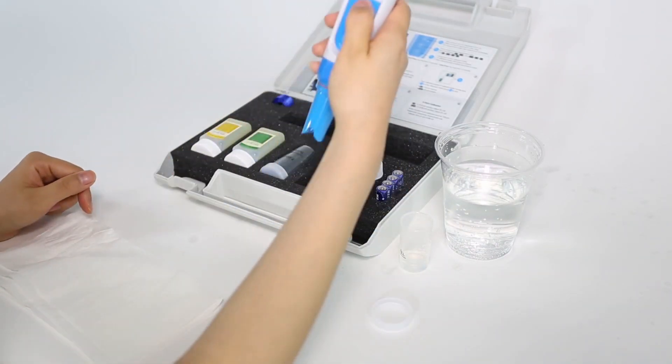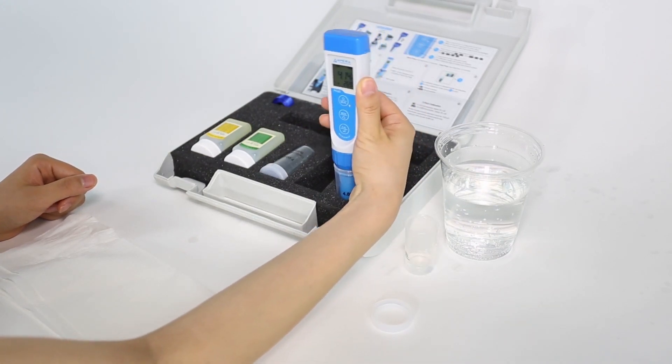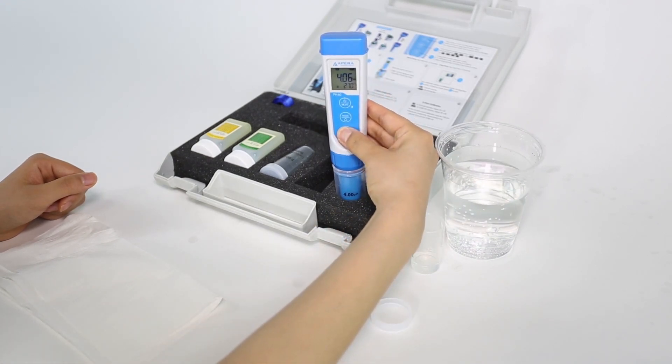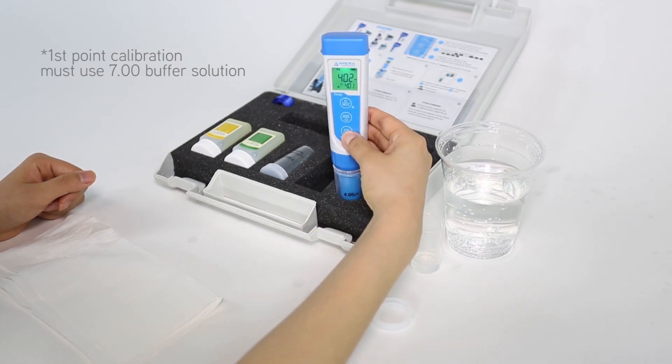For second point calibration, dip into the 4.00 calibration solution and follow the same steps that you did in first point calibration. Please note that first point calibration must use the 7.00 calibration solution.